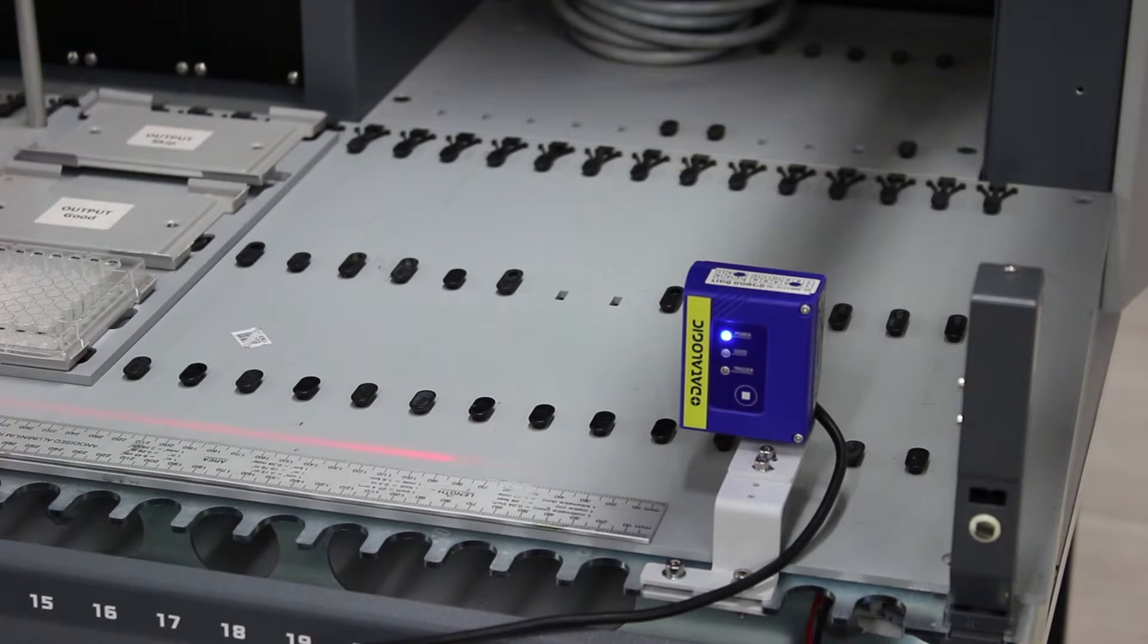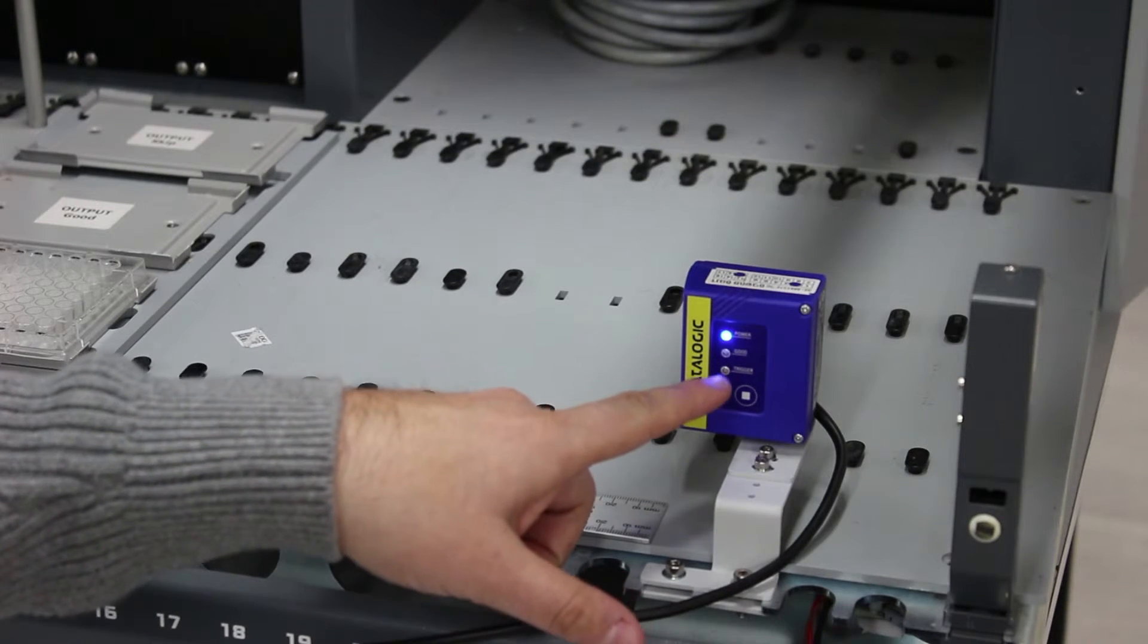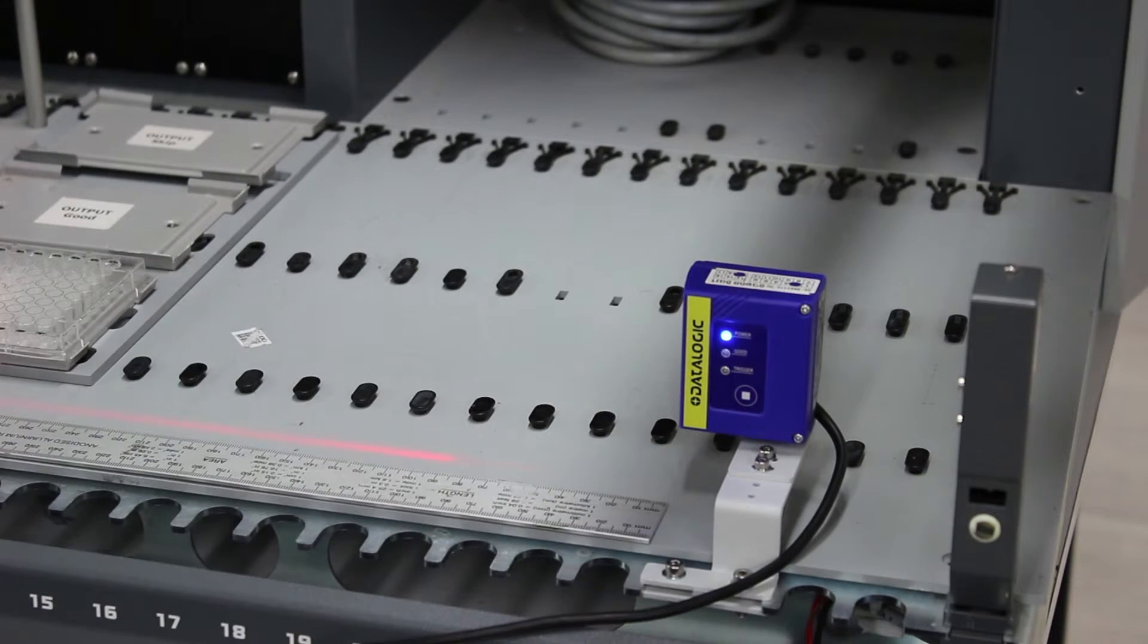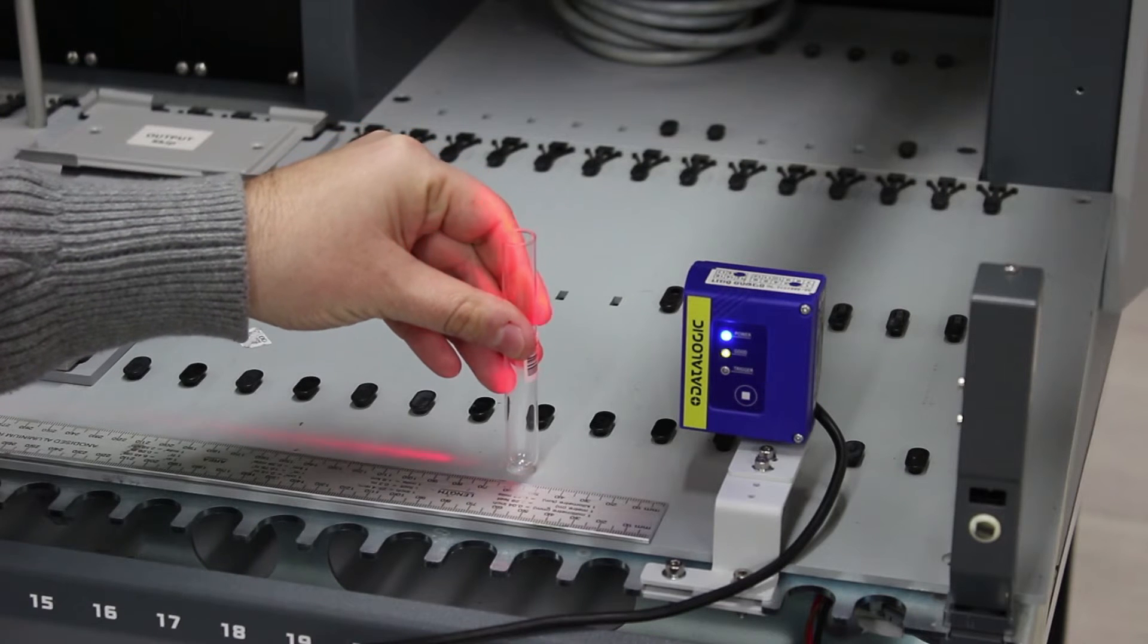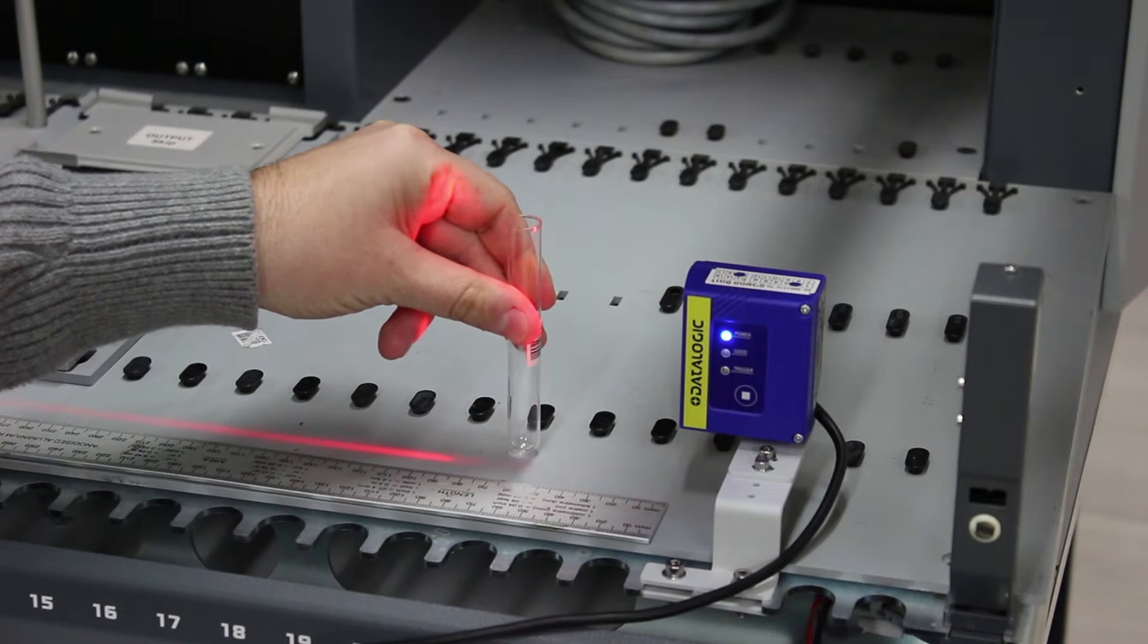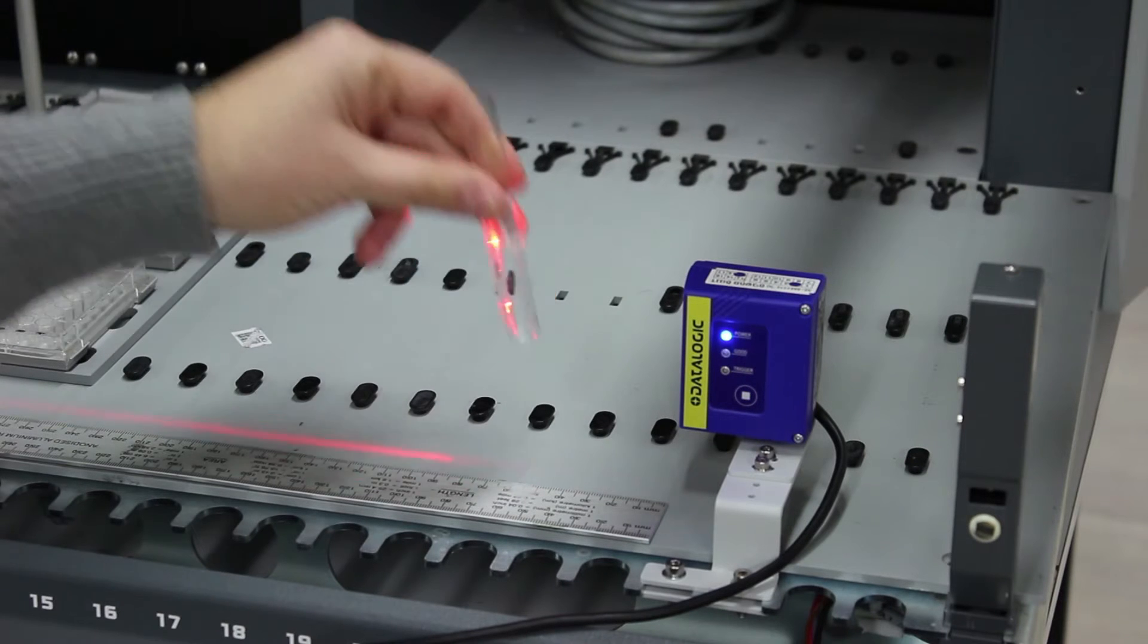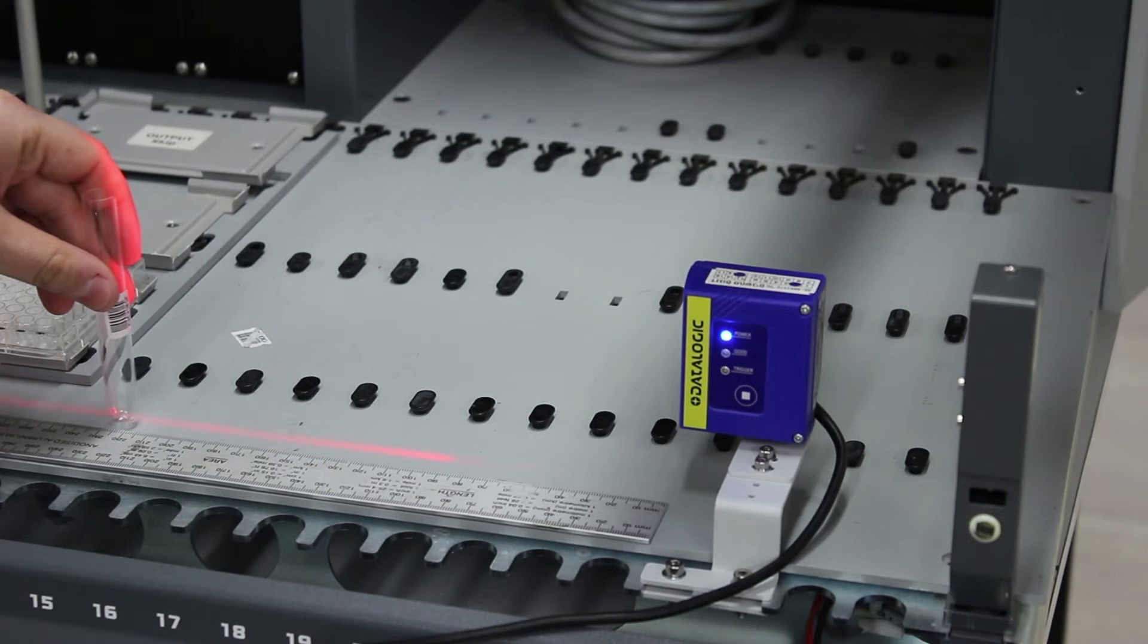To measure the distance at which the tube barcodes can be read, monitor the green GOOD LED. It flashes whenever the reader successfully reads a barcode. Here we see the tube barcodes can be read as close as 6 cm away and as far as 36 cm away.